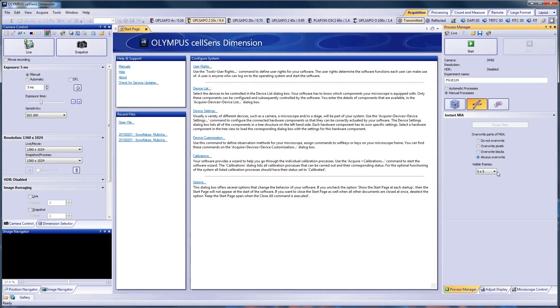The visible frame setting affects the zoom factor used to display the individual images in the Instant MIA image view. You can select between the 3x3, 5x5, 11x11, and 21x21 entries. You can also use the mouse wheel at any time during the acquisition to zoom in or out of the stitched image.